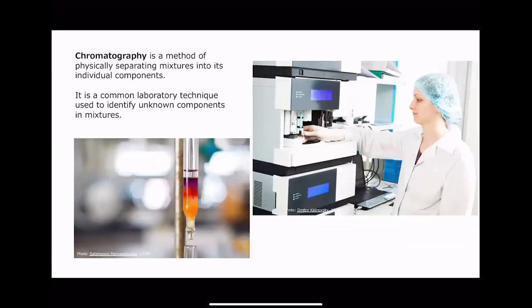Okay, so chromatography is important because it is used to separate a mixture. And it's a very common laboratory technique. It is used to separate environmental samples, like talking about these air pollutants. So this would be an example of when you're testing your regular air, you can find out how much of an air pollutant is in there. So how much is the air pollutant, which is really important in keeping our air fresh, how much of one air pollutant is present? So when you're trying to figure out how much of one of the parts in the mixture, that's when you're going to use chromatography.